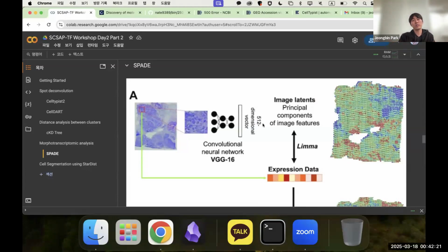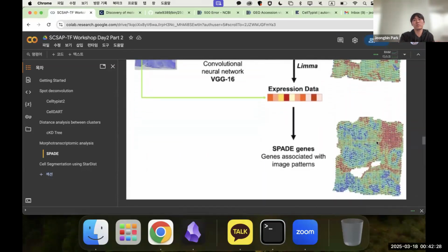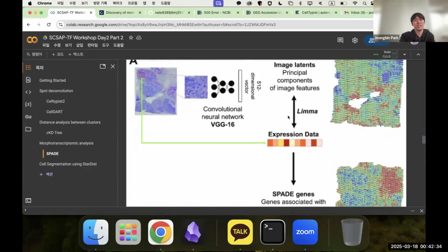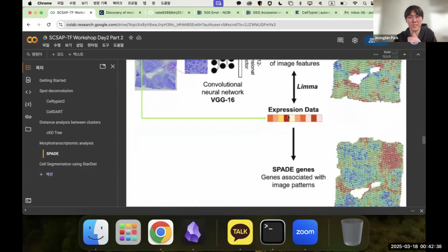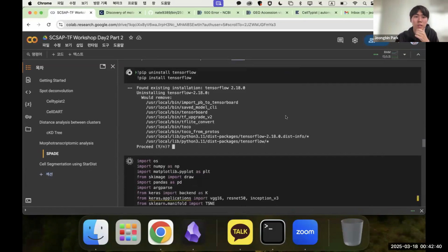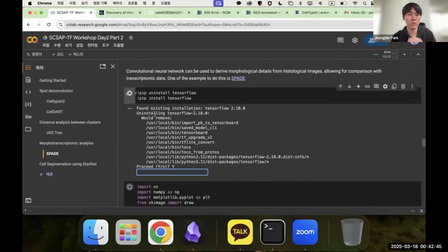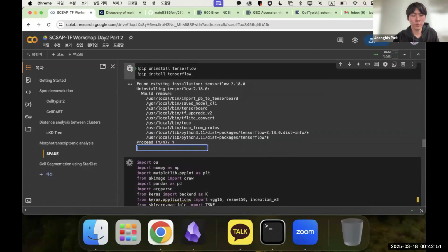And we can extract the principal components of those dimensional vectors, and those variable features could be related to biological signals, in an unsupervised way, right? So who knows? You should name it. Signatures are there. So I think it takes time. I want to skip that, but I want to show you a few points of that.